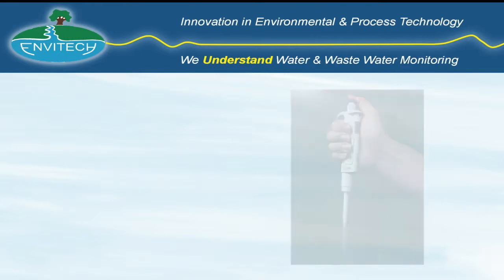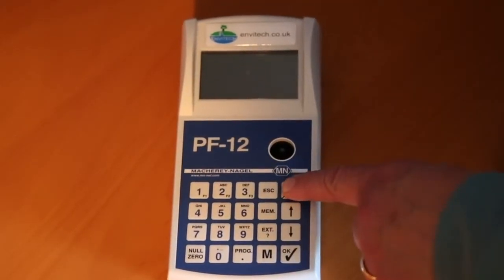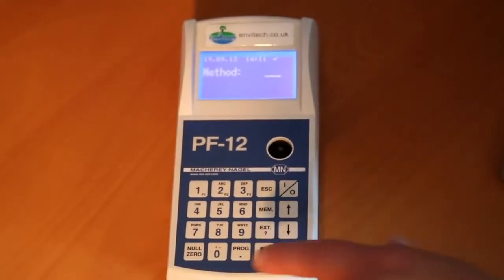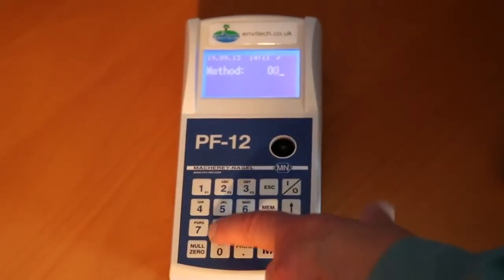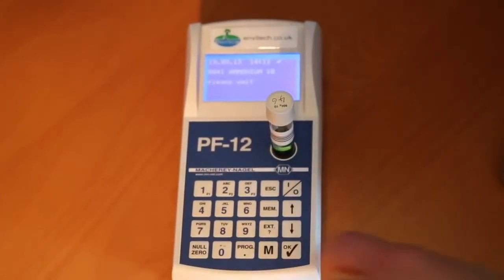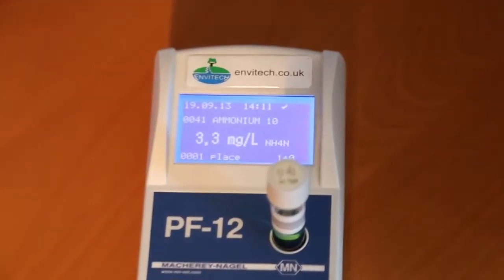Colour development is allowed to complete for the required time. Switch on the PF12 by pressing the on-off button and then select the correct test by entering the code number of the test given on each box of tubes. Insert the sample tube into the correct aperture and press the M key. The result will be displayed on the screen and stored in the memory for subsequent download.